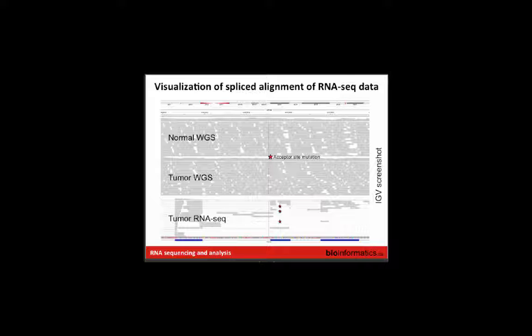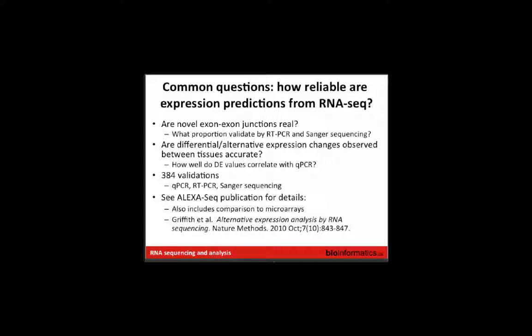Just, yeah, transcription noise. There's sort of a lot of possible sources of this noise. Of course, it could also be an alignment artifact. So maybe those reads don't really go there. Maybe those reads belong somewhere else, and they've been misaligned to this region.